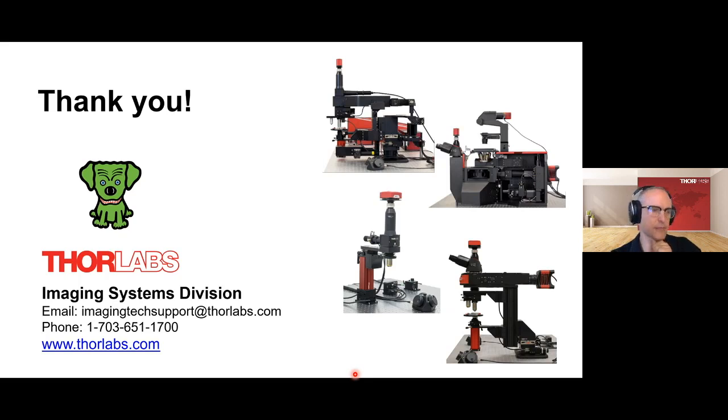Okay, are fluorescence microscopy and bright field microscopy also wide field microscopies? So fluorescence, no, we talked about that; fluorescence underlies wide field, confocal, and multiphoton. Transmitted light microscopy is typically used with wide field, although I'm sure there are some exceptions out there, but it is typically used in wide field imaging. Okay.